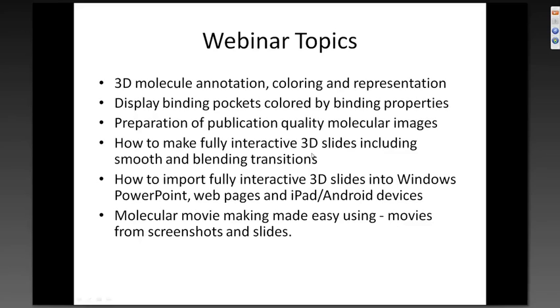So the webinar topics for today are: we're going to read in 3D molecules from the Protein Data Bank. We're going to annotate them, color them, and demonstrate how to change the representations, for example, ribbon and stick. We'll display binding pockets and active sites, colored by binding properties.